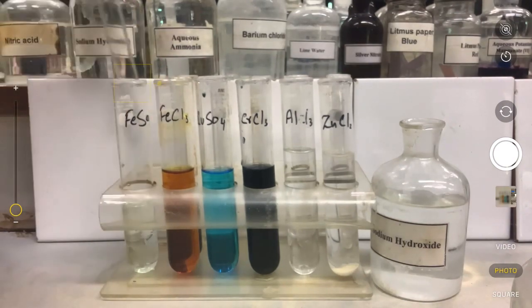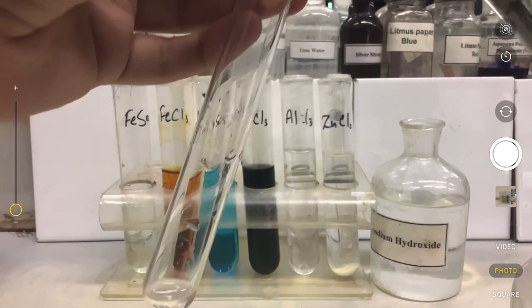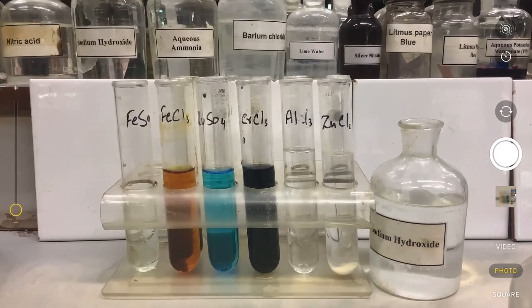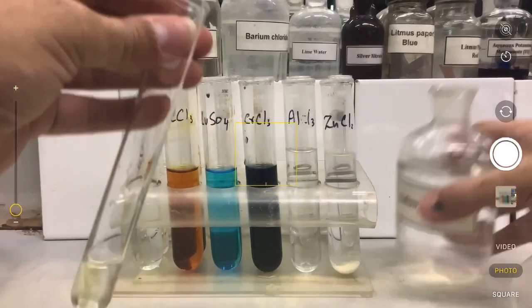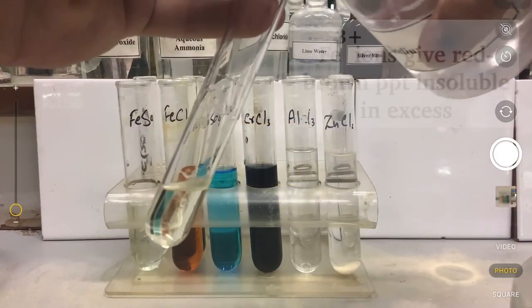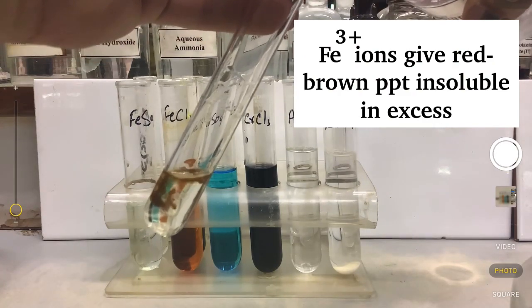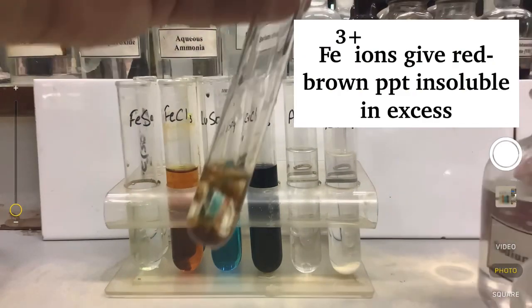Now let's take a clean dry test tube and take a small amount of sample of this salt. I'm going to add aqueous sodium hydroxide drop by drop in the sample. You will be able to see that red-brown precipitates are made.